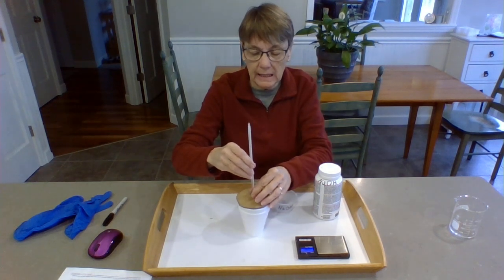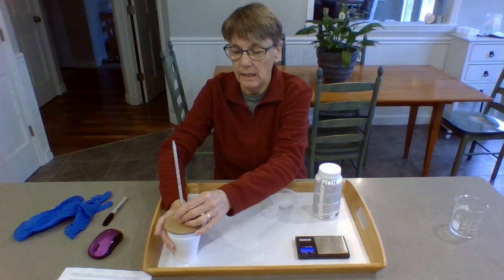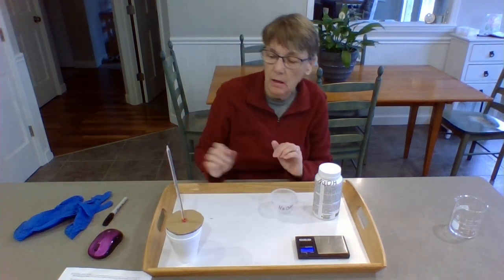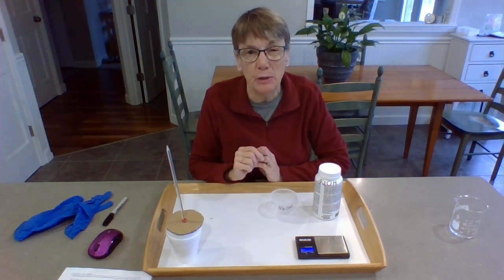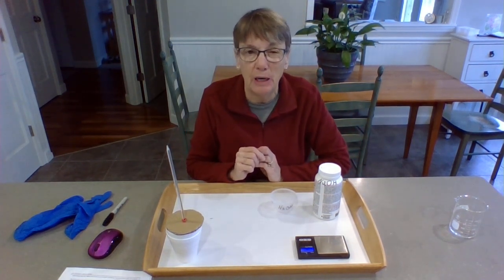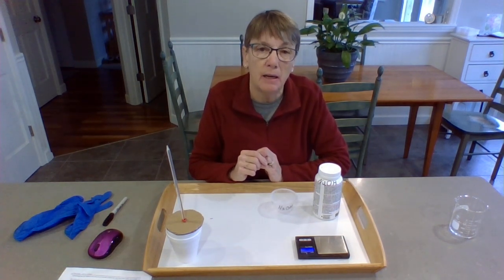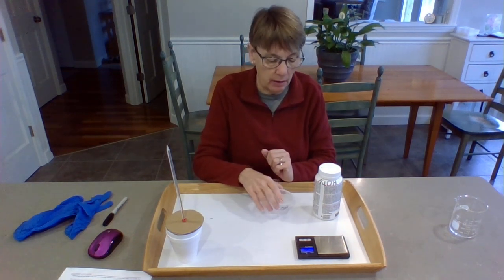Okay, so I'm going to let that sit for a little bit so we can get an accurate temperature when we start. Whatever temperature is going to be here when I'm ready to start, that's going to be my initial temperature. So these calculations we're doing are very similar to what we did in Chapter 13, only instead of measuring specific heat capacity, we're actually measuring how much heat is given off.